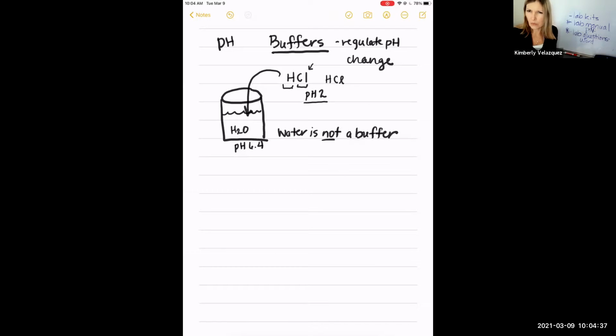So in the experiment this week, your entire first row on that test tray is water. Okay, you're going to have the very first cell, A1, is going to be just water and the pH indicator. In other words, what is the starting pH of your water? And then all the way across, it's just water, it's not buffer. So you're going to have water, you're going to have 1 drop of acid, which is hydrochloric acid, and you're going to have your indicator.